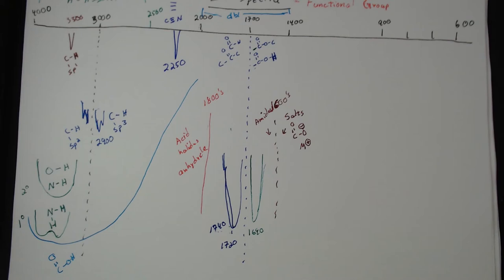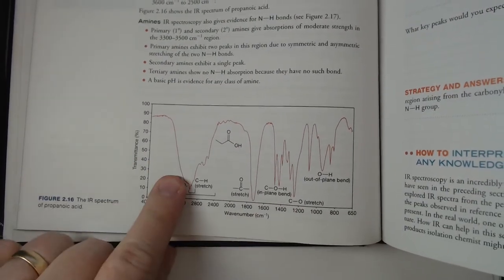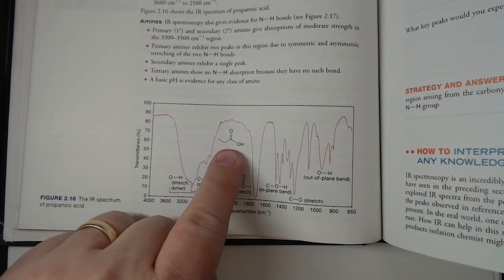During 242, we'll focus on aldehydes and ketones for two chapters, and acids and acid derivatives for at least one or two more. The carbonyl functional groups are very important. One trick question is: how do you distinguish the four basic carbonyl functional groups from the IR absorption? The answer is, you cannot — it's a trick question. Aldehydes, ketones, esters, and acids all look identical in the carbonyl zone, so to identify which one of these four you have to look elsewhere. The most automatic of the four is the carboxylic acid, because it gives a strong carbonyl peak and the hydrogen zone is wiped out.